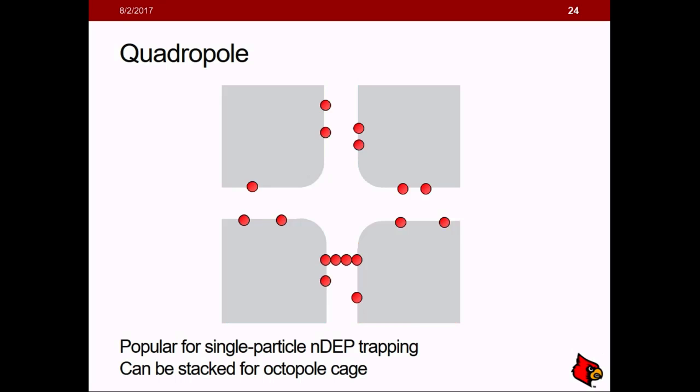You may have pearl chaining. That makes sense. Now, negative dielectrophoresis, think about where the field is weakest. This is a top view. We're assuming planar electrodes, so your electric fields would look something like this. So here's your field null. That's where the weakest point is. And yes, that's where you would trap particles with negative dielectrophoresis.